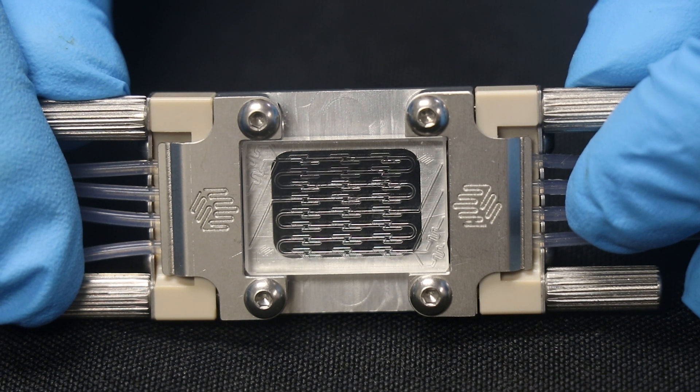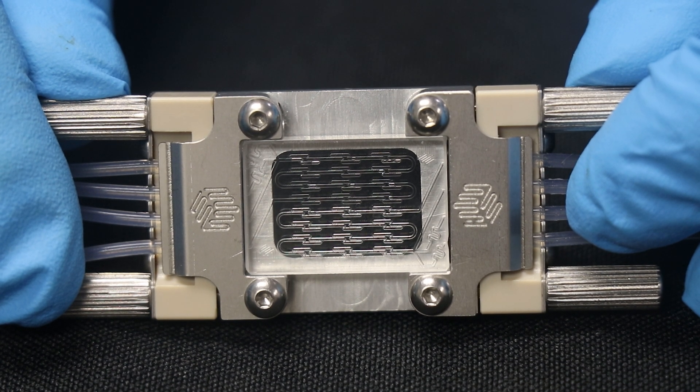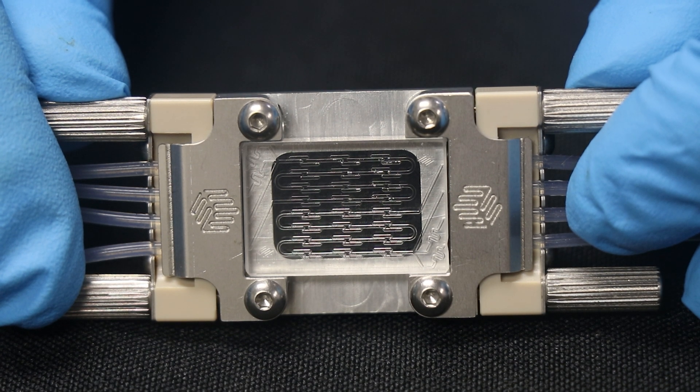We are using a glass micromixer chip with herringbone design. This chip is designed to have two separate flow paths. As you can see, only the top flow path is being utilized here.